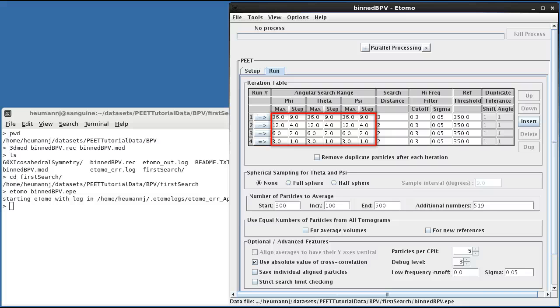The first search covers a 72-degree range for each particle. Recall that an icosahedron has a number of 5-fold rotational symmetry axes, which suggest a 72-degree search range should suffice. Additionally, the distance between neighboring 5-fold axes is also less than 72 degrees. It's because of this limited search range that randomization of the starting orientations helps suppress missing wedge artifacts. If a full spherical search was used, that option, while harmless, would not improve the results.